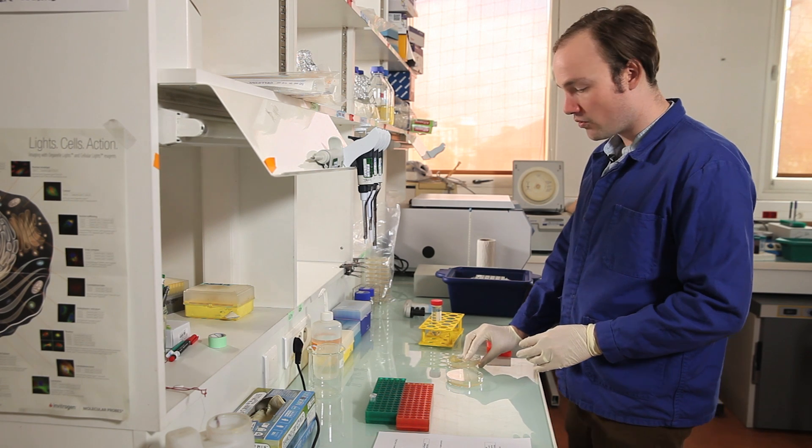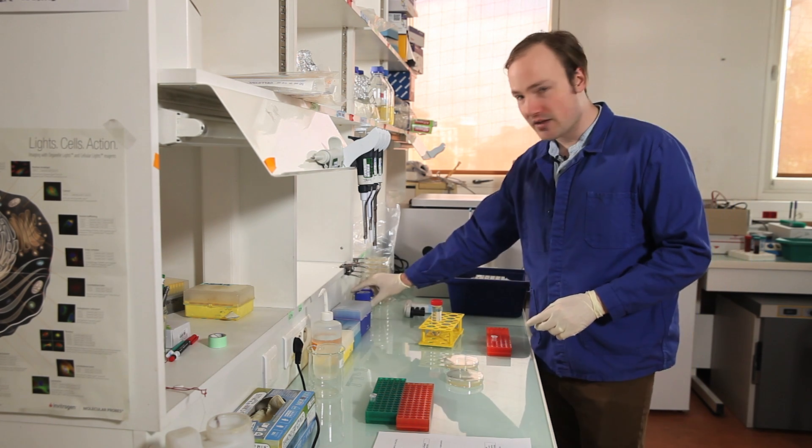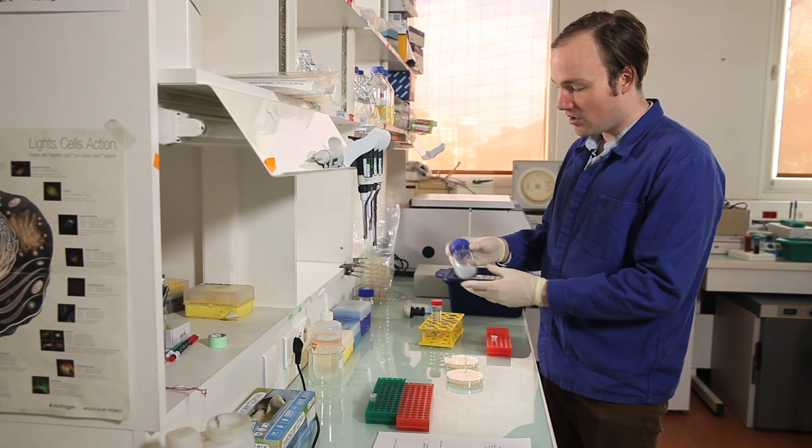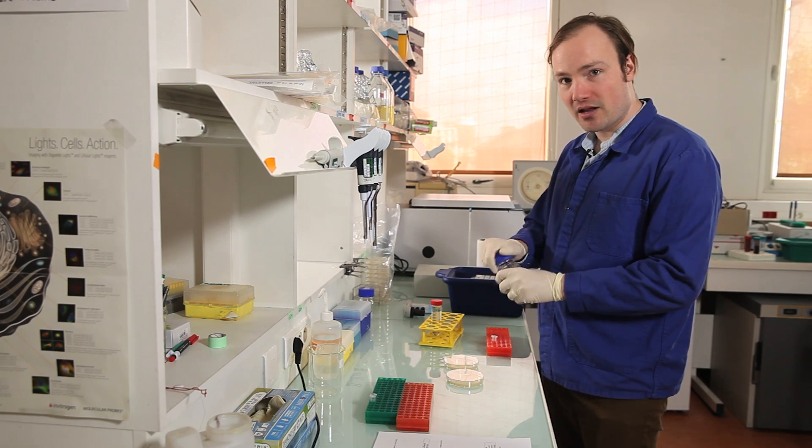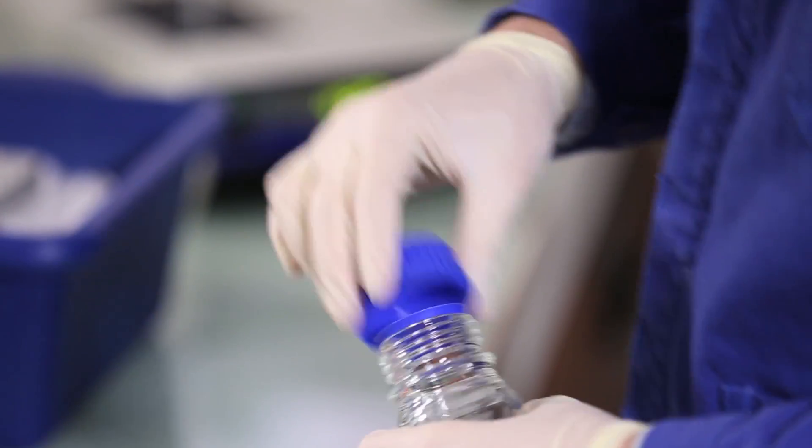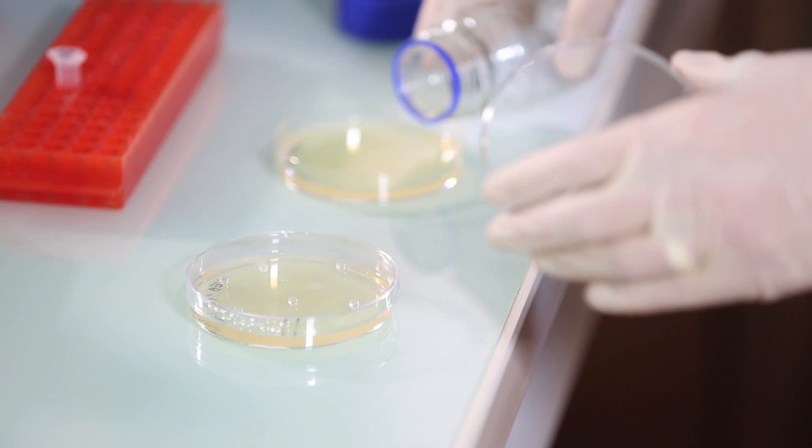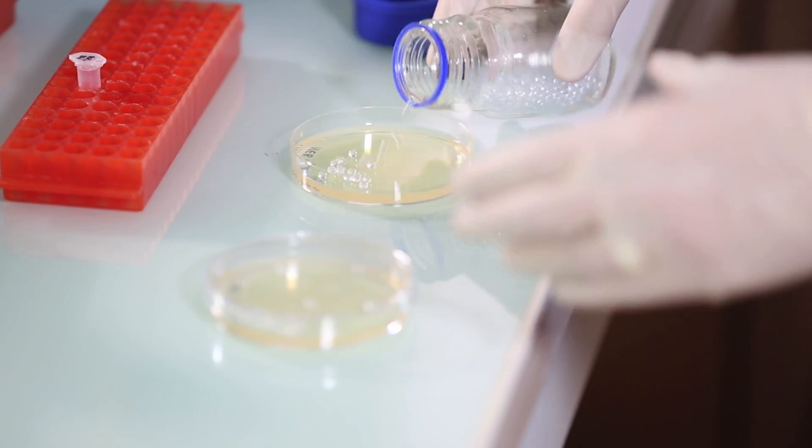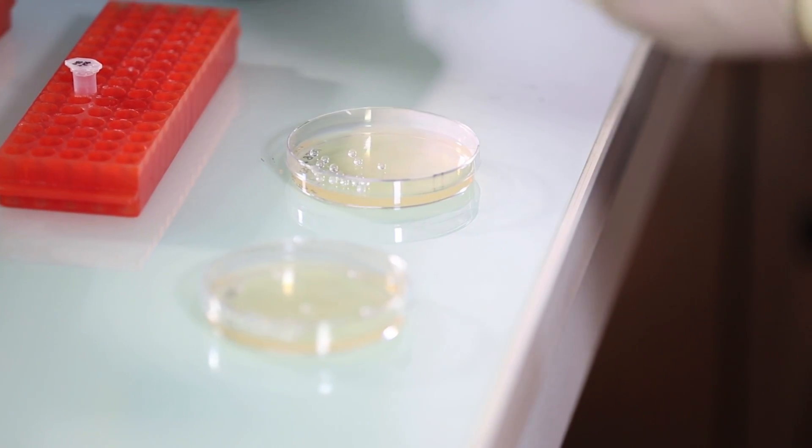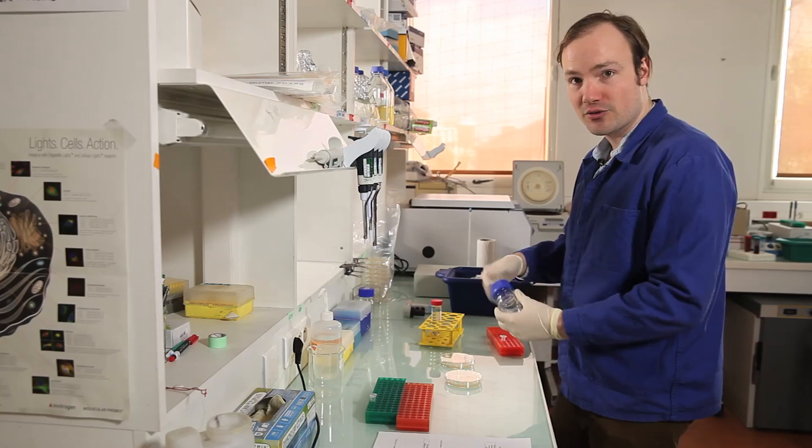Okay. So to plate these cells, I'm going to use these. So these are glass beads that I'll add to the plates. And they have the effect of spreading the media evenly around the plates without absorbing too many bacteria. And so they're going to give us a nice even distribution of bacteria on the surface of the plates.